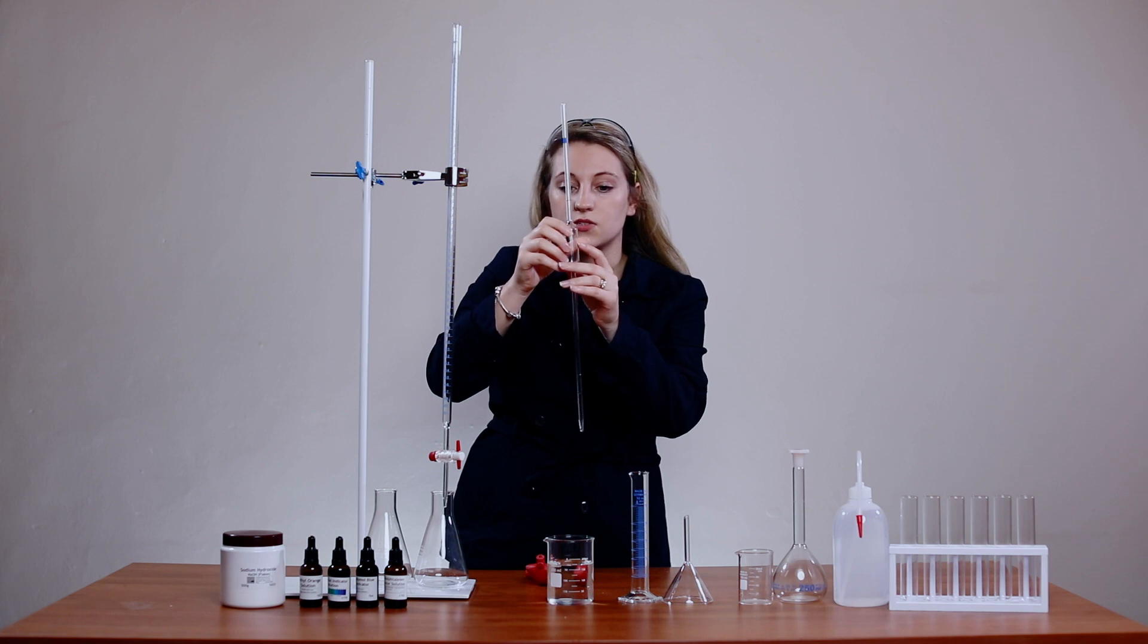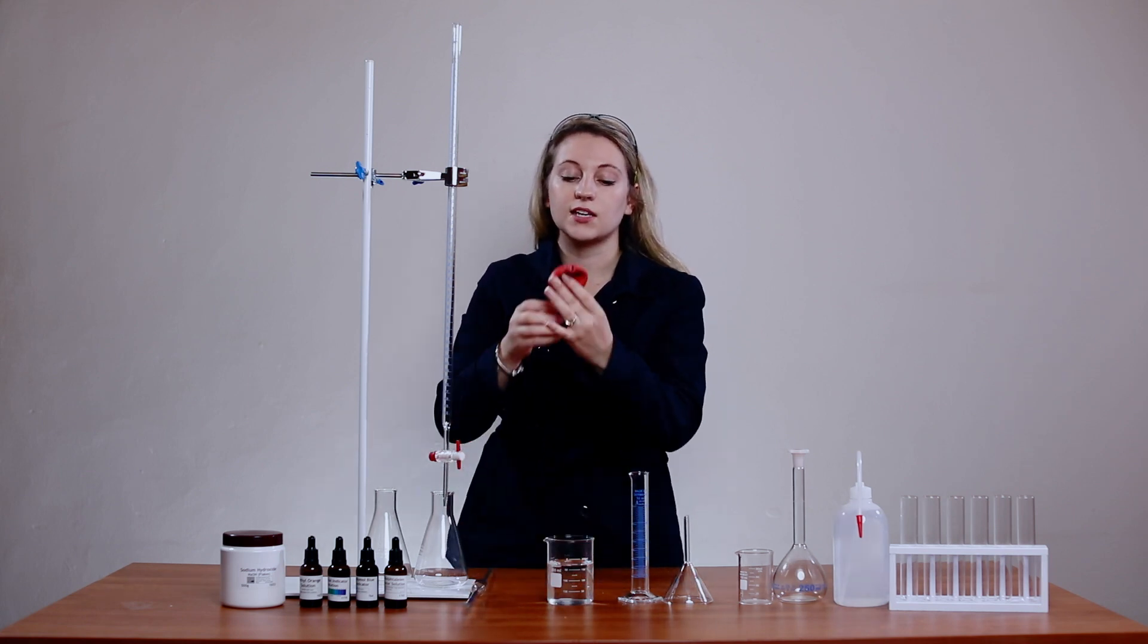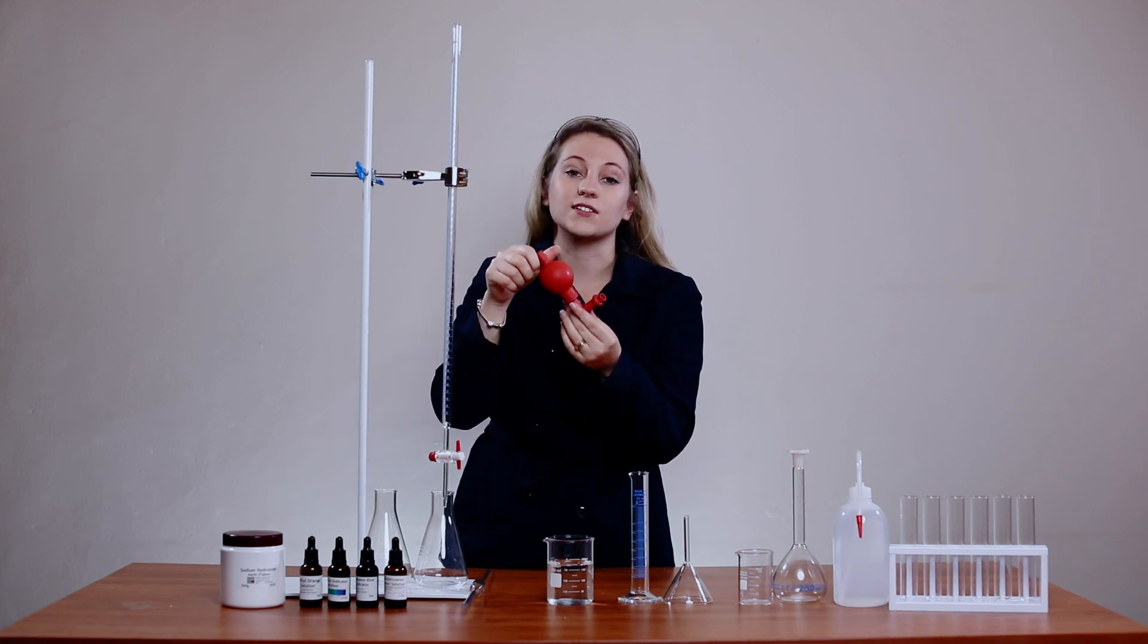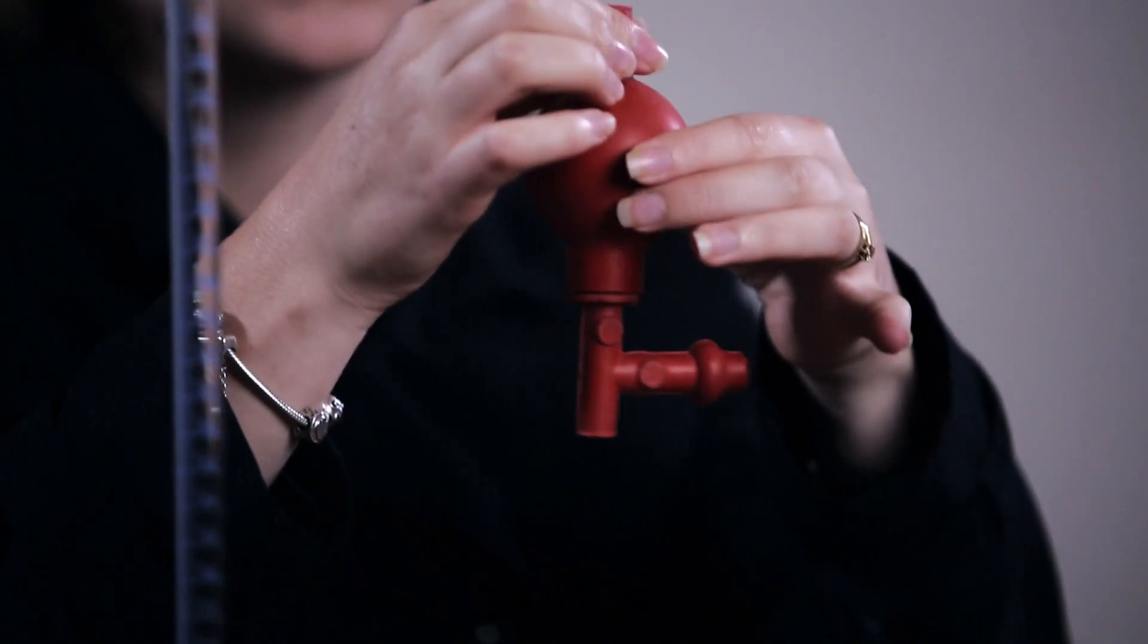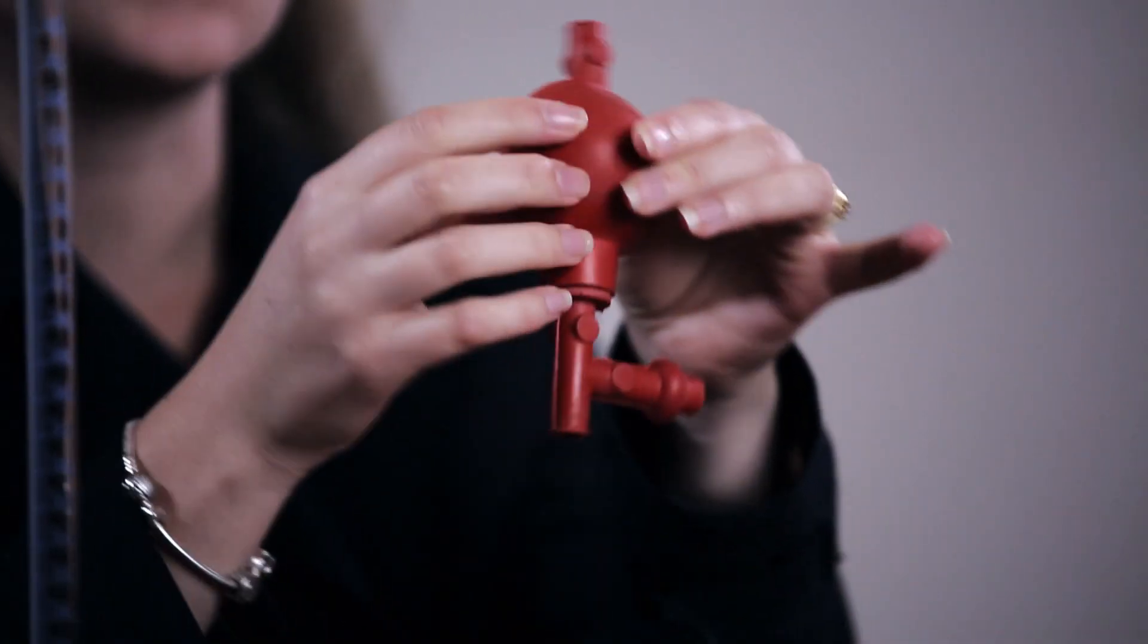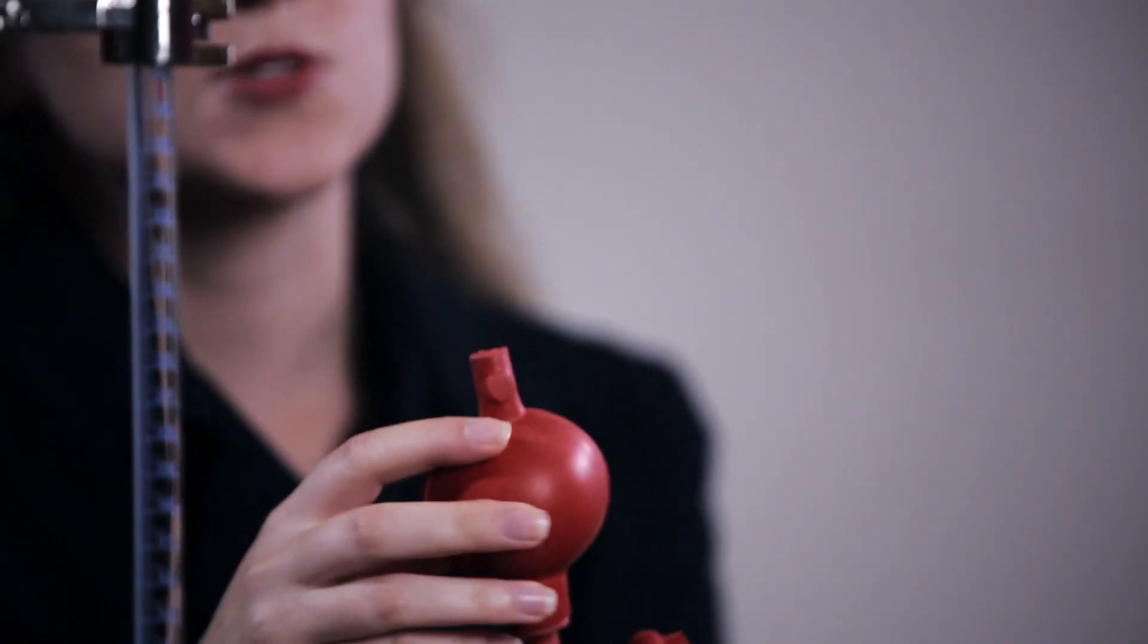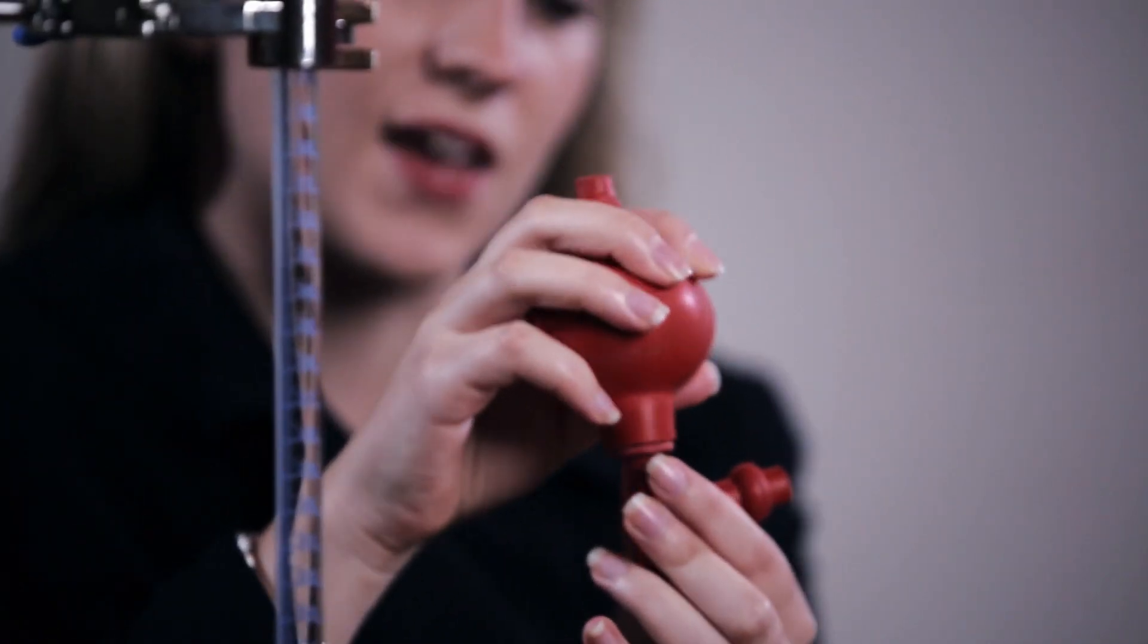To suck up the liquid you need a red pipette filler. These guys are quite fragile and it's so easy to suck up the liquid into this rubber bulb and you don't want that to happen, especially if it's acid, because your acid can then eat the rubber.